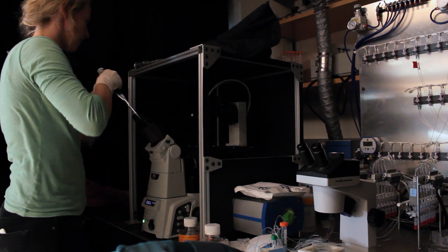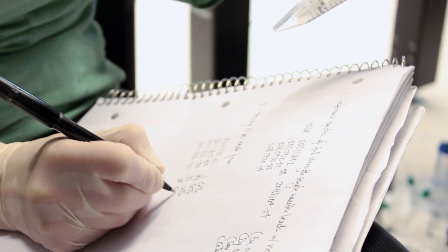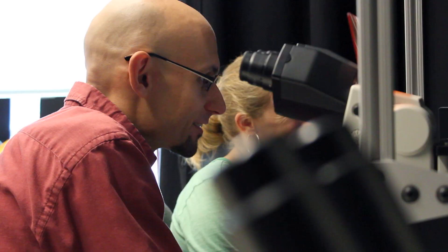We're really looking for a broad range of participants from academic and industrial backgrounds. We even hope that this kind of course would be a jumping ground for students who want to go on and design new microscopy techniques, to have a grounding in the fundamentals that they can then apply to new kinds of approaches in biology.